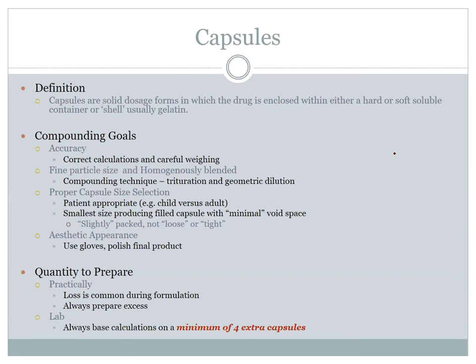The other thing, which explains the drop of food color that we're going to talk about later, is you have to homogeneously blend, because it's not just active drug. Have you ever seen a 1 milligram tablet or a 5 milligram tablet of a drug? If they were pure drug, then that tablet would only weigh 1 milligram or 5 milligrams. You can't even hardly hold 1 milligram. You can barely see 1 milligram of powder. So understand that all of your commercial tablets and capsules are not just pure drug, or bulk drug powder.